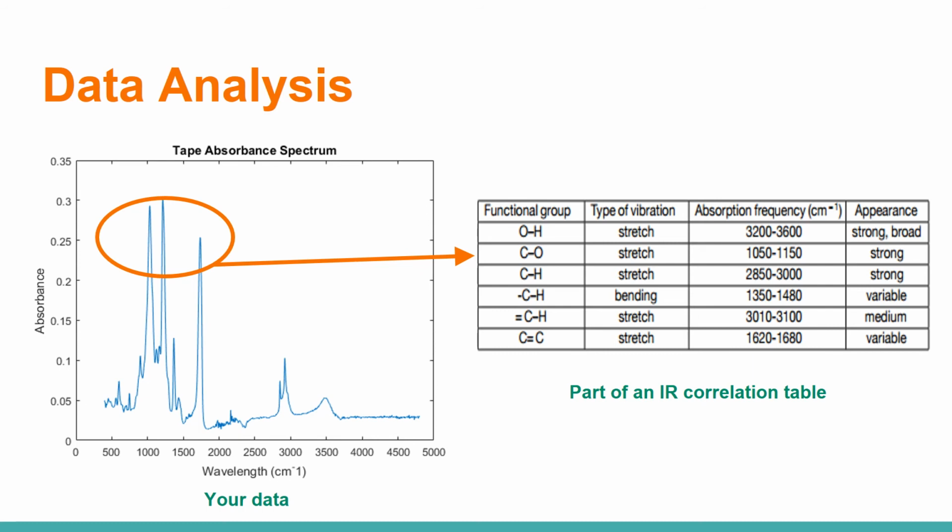So specifically, this is Scotch tape that Anwar lent you, and as you can tell, once referencing to a data standard, the type of bond, the type of vibration can be obtained. Essentially, stretching is just when the bonds only move in a longitudinal direction. Bending, meanwhile, incorporates 4 subtypes of motion, which are rock it, wag it, scissor it, and twist it. And those are pretty much exactly how they sound.